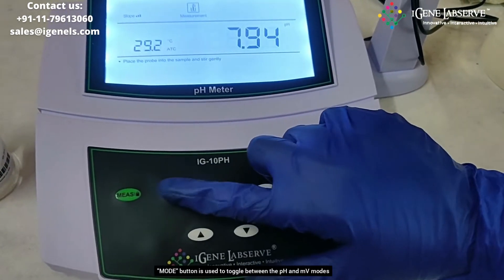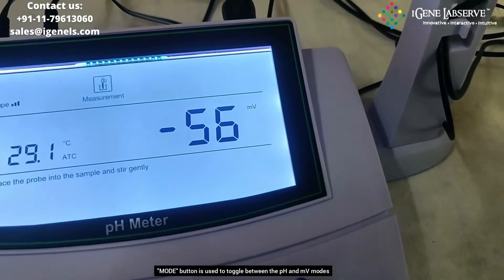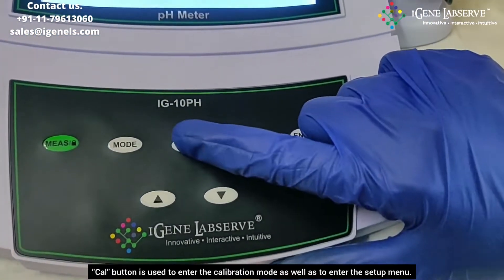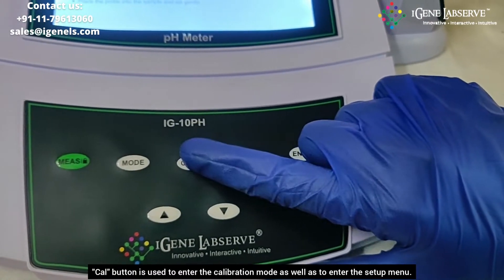The mode button is used to switch between the pH mode and the mV mode. The third button, which is the cal button, is used to enter the setup menu as well as enter the calibration.